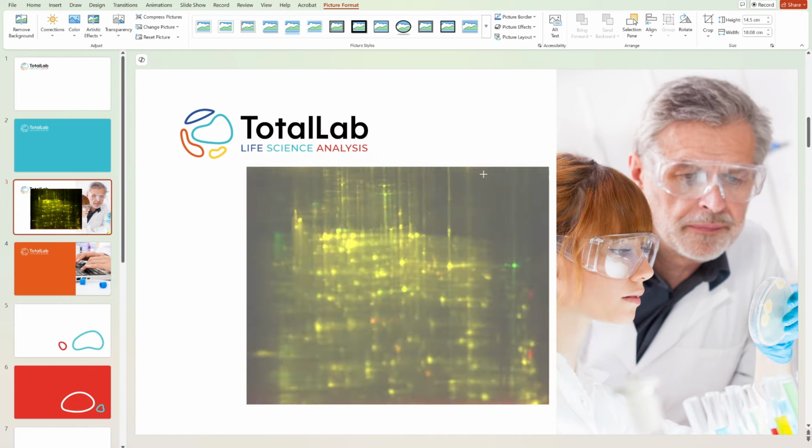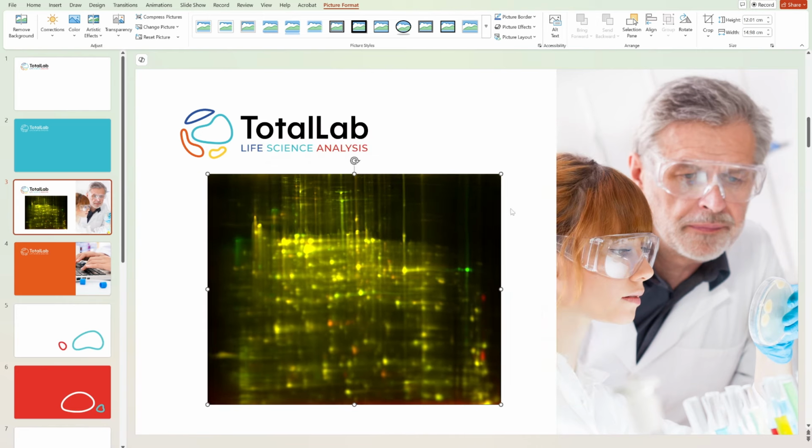So those are all of the methods that we have and all of the ways that you can take the images from a very visual technique using our SpotMap software and put it into your LIMS system, your internal reporting, your QC reporting, or even just include it in your marketing materials if you are a service provider for 2D services.